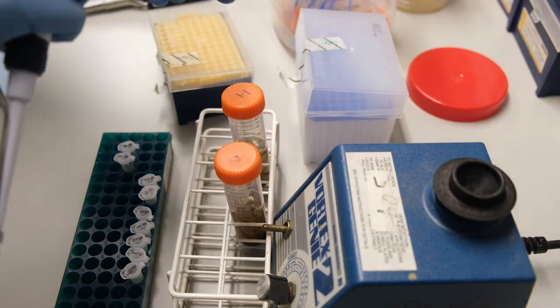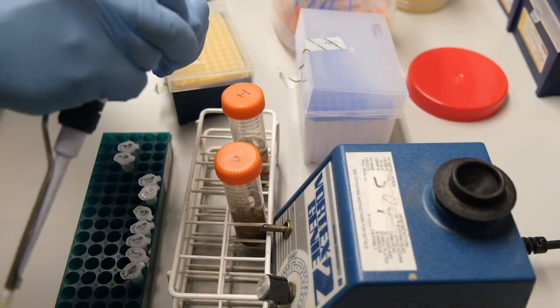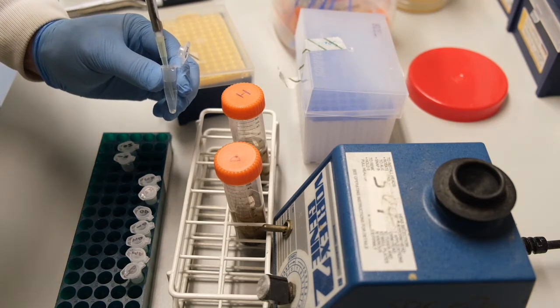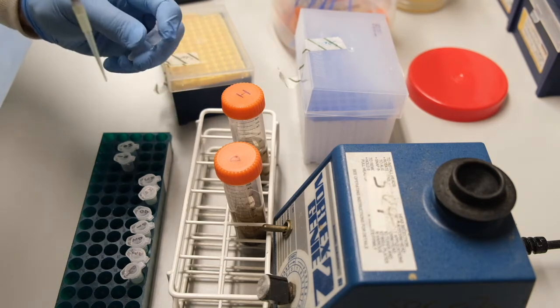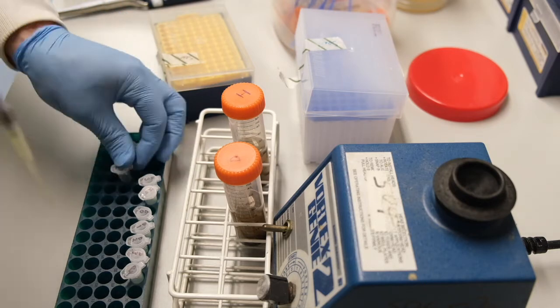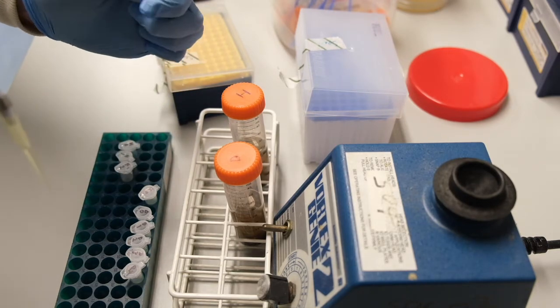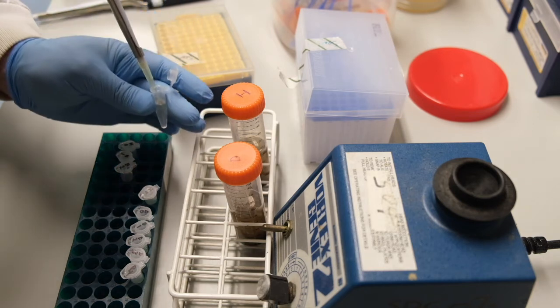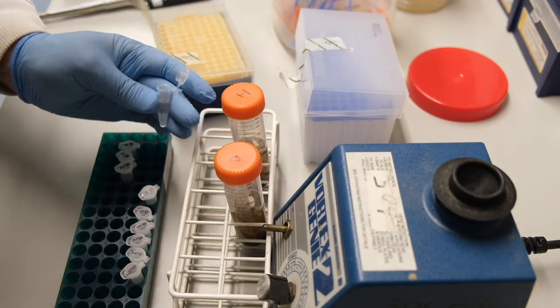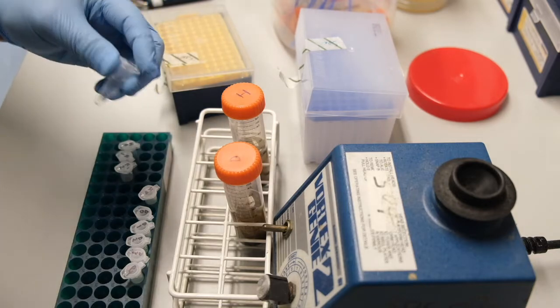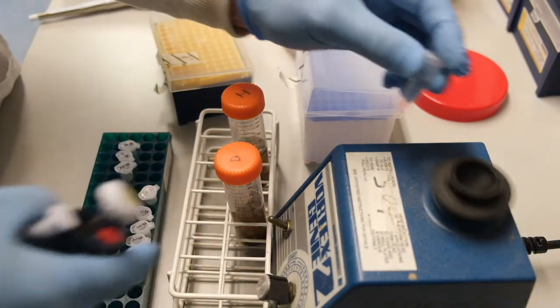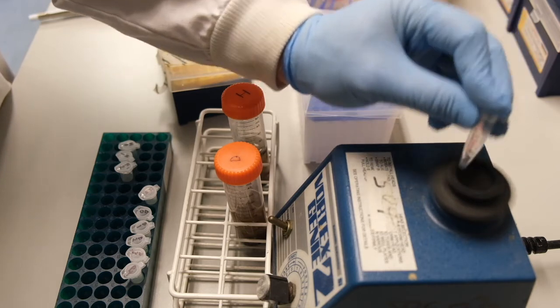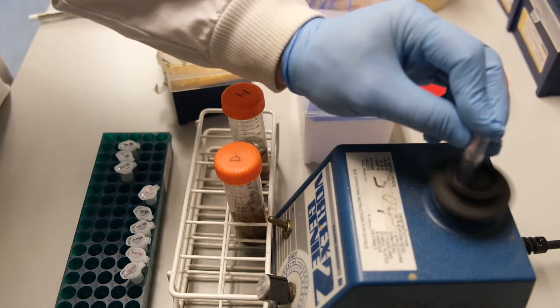Make sure you use a fresh yellow tip for each transfer. We pipette 100 microliters from the 10 to the minus 2 dilution into 900 microliters of ringer solution to make the 10 to the minus 3 dilution. Mixing thoroughly, we repeat to make the 10 to the minus 4 dilution.